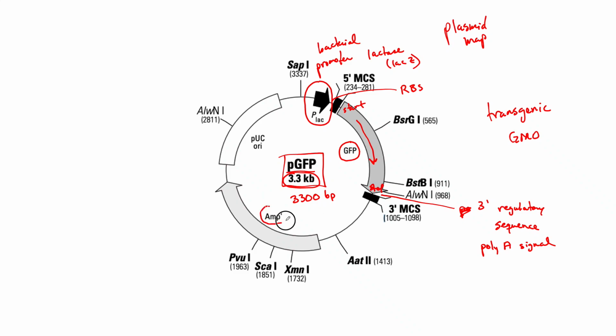There's another gene. There's actually two genes on this plasmid. The other one is called an ampicillin resistance gene. And this gene contains the codons that will produce the protein beta-lactamase. Now what this protein will do is it will give to the bacteria a special power.